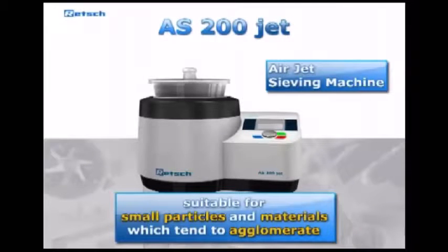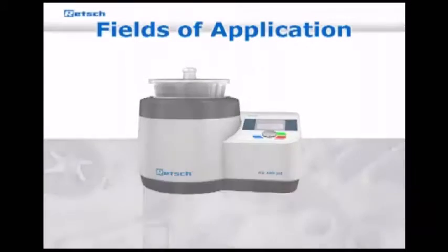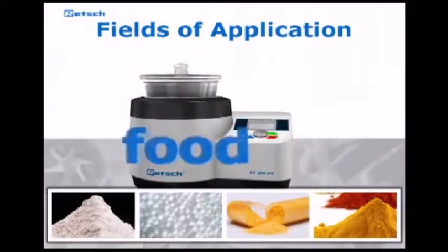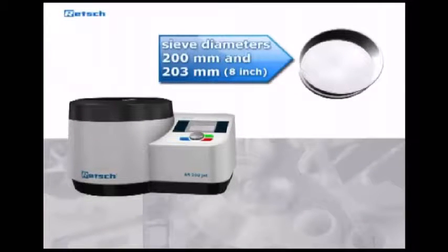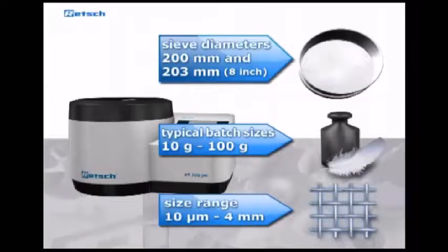The AS200 jet is particularly suitable for small particle sizes and materials which tend to agglomerate. Therefore, the sieving machine is primarily used in the following fields of application: construction materials, especially cement, plastics, pharmaceutical products, food. The AS200 jet works with standard sieve diameters of 200 and 203 millimeters. Typical batch sizes range from 10 grams to 100 grams. Particles in a size range of 10 micrometers to approximately 4 millimeters can be classified.